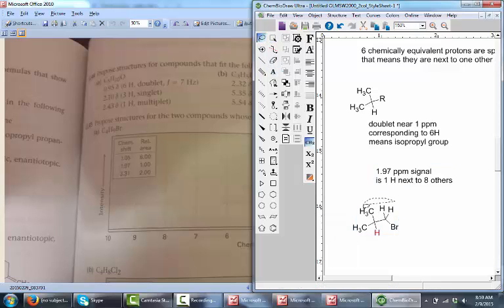These blue protons are split only into a doublet, which means that their neighboring carbons can include only one proton on it, okay? So this other linkage on my carbon can't have any protons directly attached to it, or else that would cause further splitting in the blue protons.